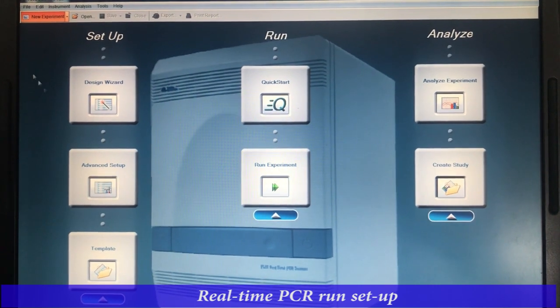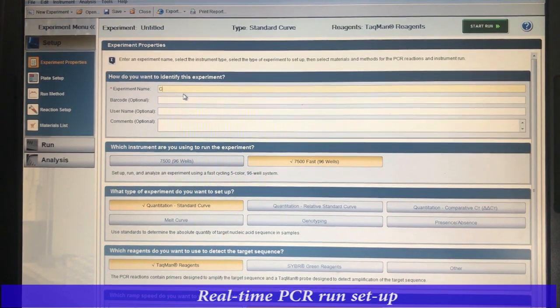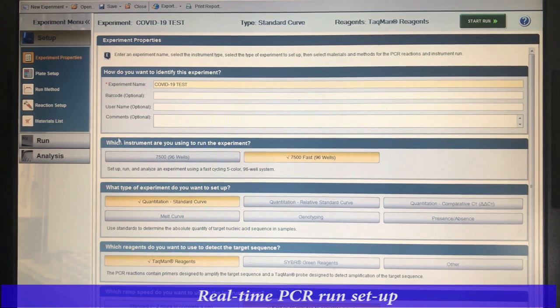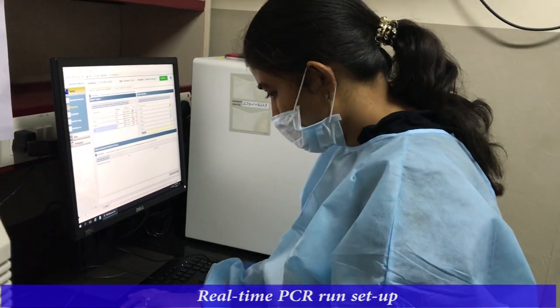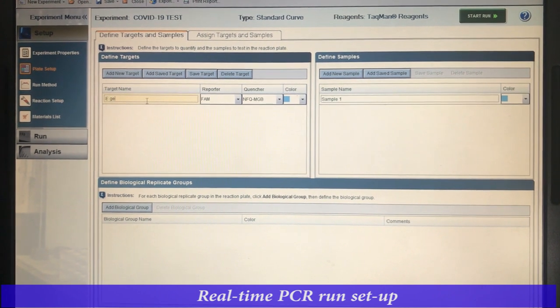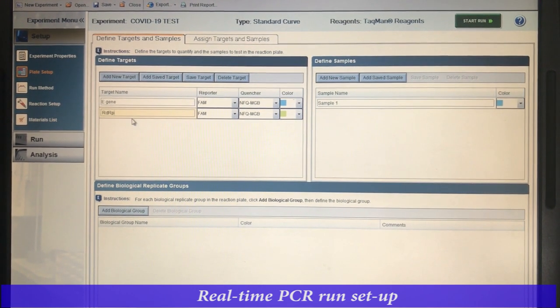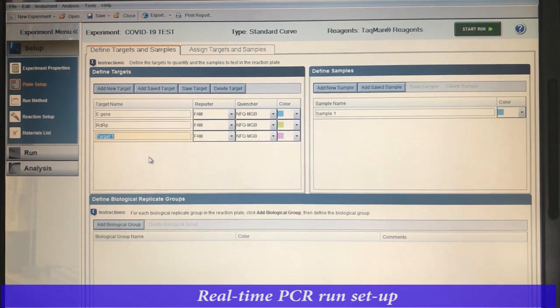Turn on the real-time machine along with the computer system. Open the software and open a new file. Give a name to it. Select properties such as machine, assay, and reagents. Next, go to the plate setup. Select the targets along with dyes. Select the number of samples and assign the samples, NTC and PC to the respective targets in the plate layout.